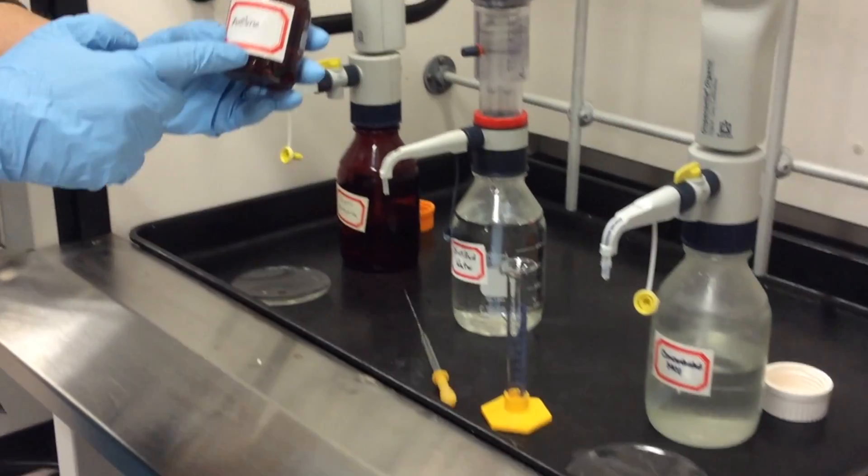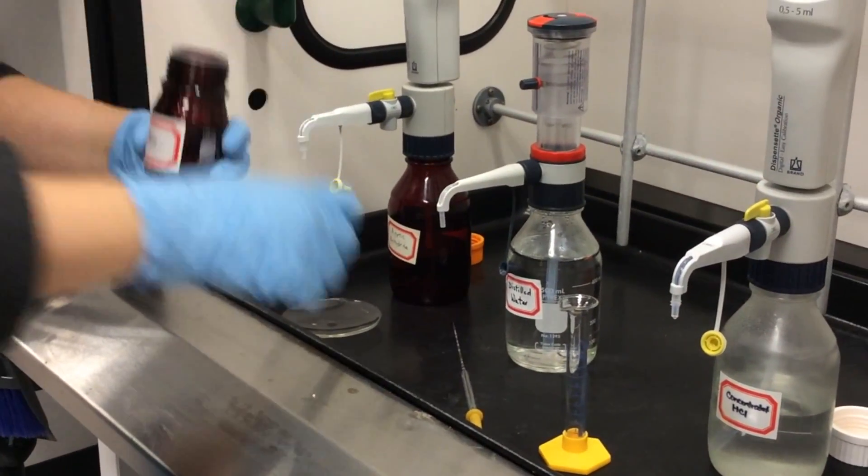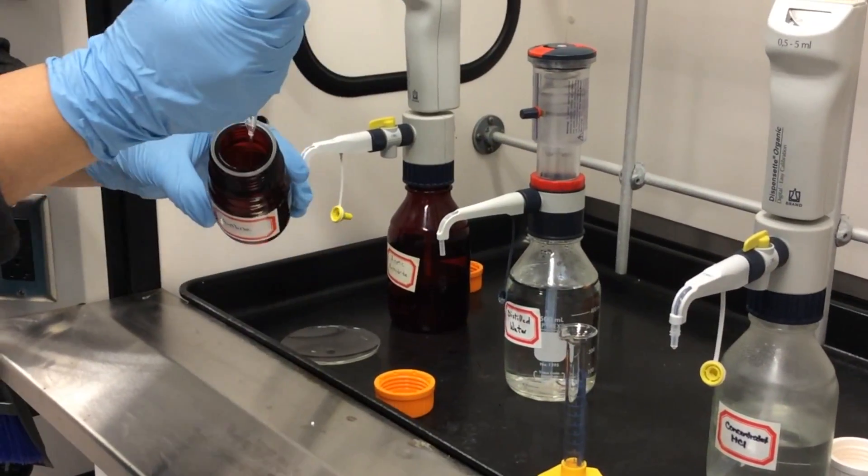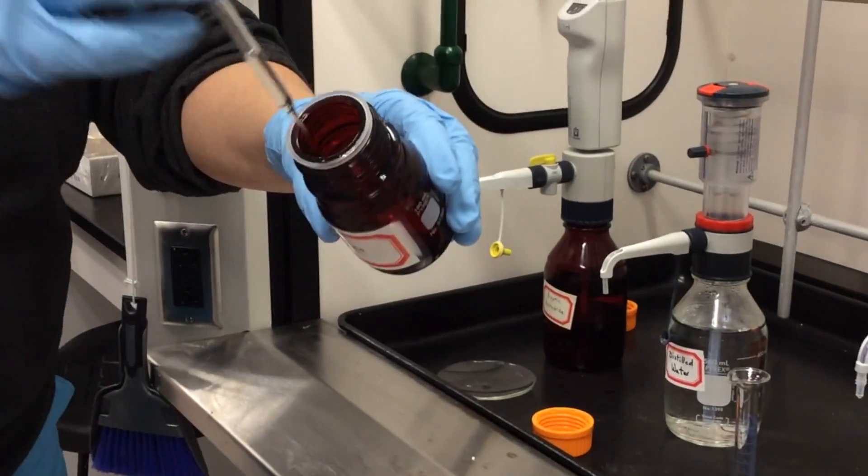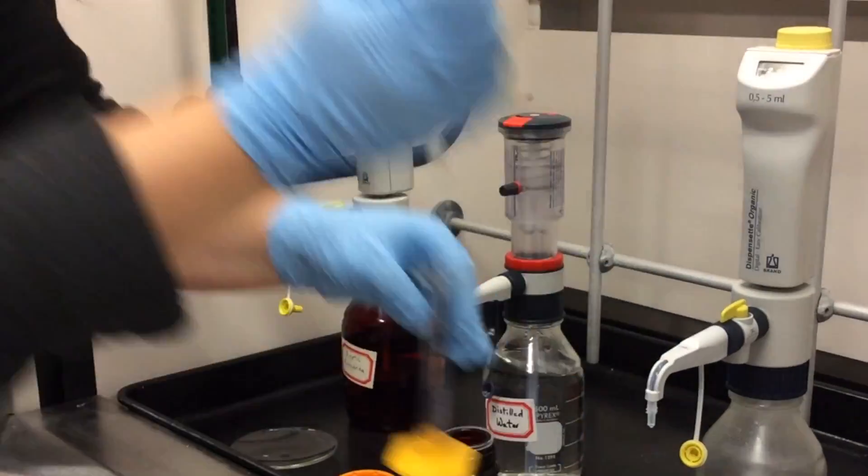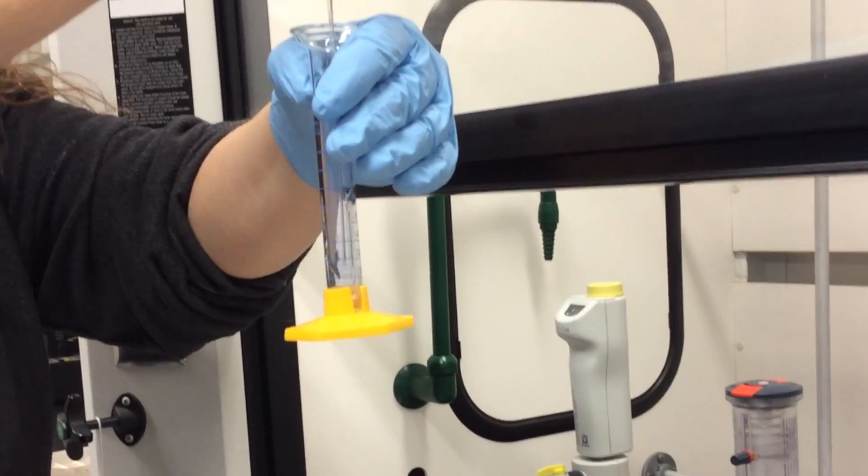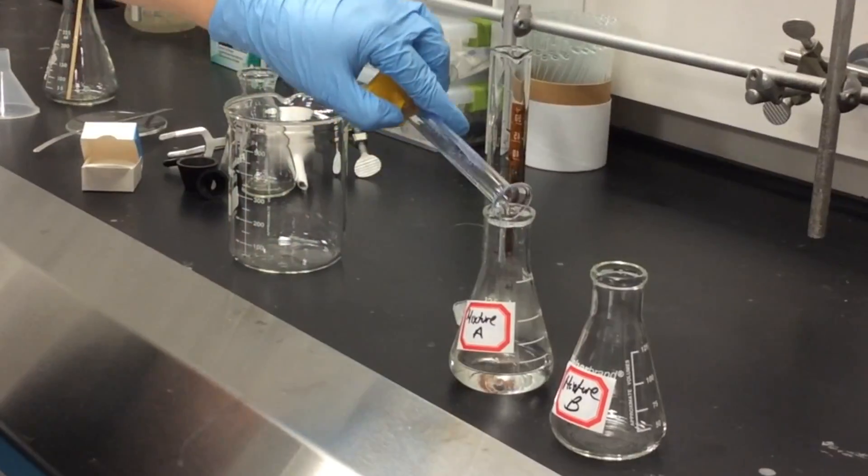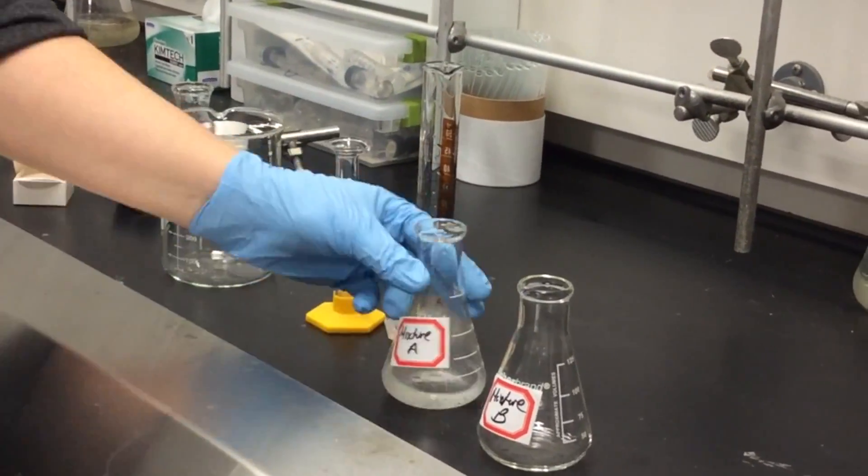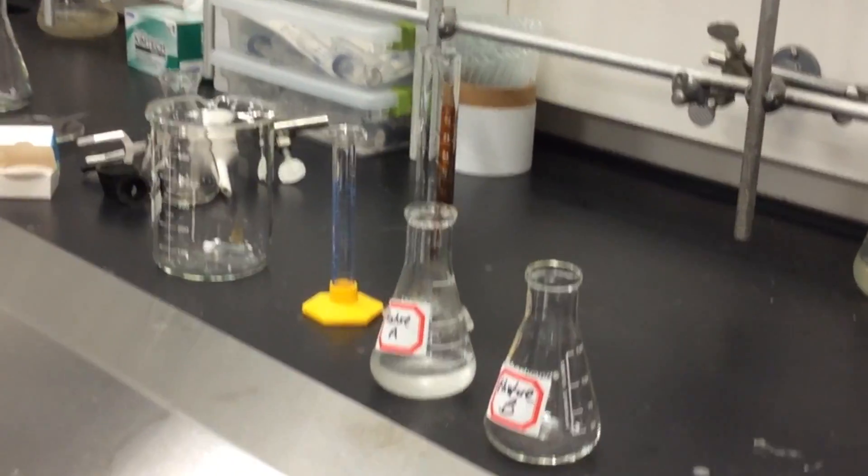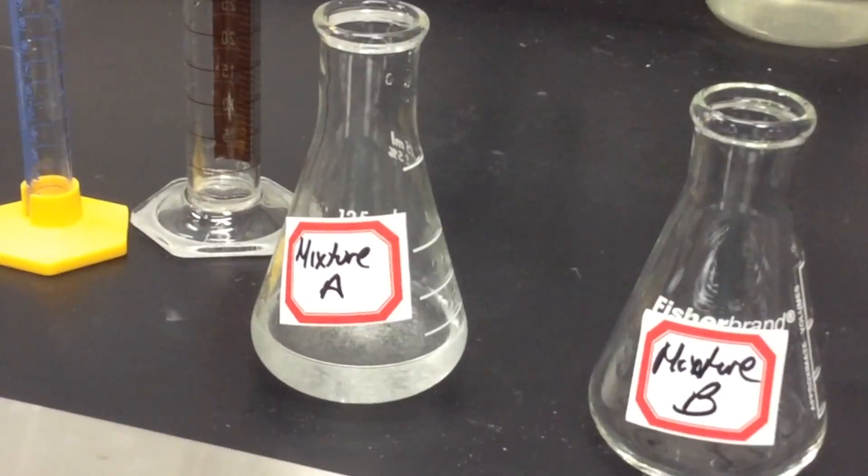Next, we're going to go back to our dispensing hood, open up the aniline, pipette out two milliliters of aniline, put it in our graduated cylinder, and then take that aniline back to our hood and pour it into mixture A. Now swirl mixture A, put it on the hood, and let it sit.